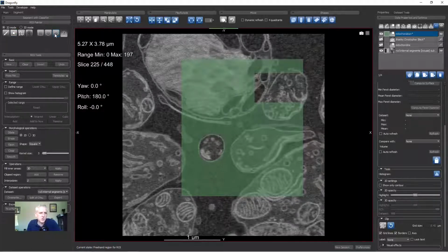So all of the region tools work the same way. That is, they allow you to create a 2D region. So this is a polygon tool. We saw the freehand, or what looks like a lasso tool. There's also an ellipse tool for adding or erasing.